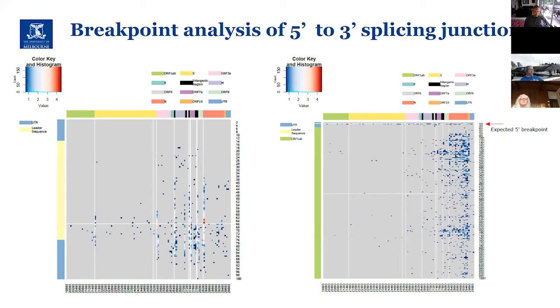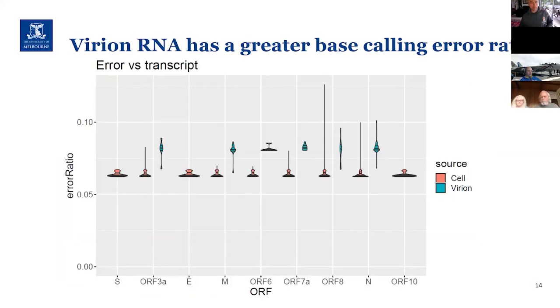Now, as to whether the ORF10 material gets translated into protein, that may not be the case because it will probably encounter a stop codon before it gets to that point. But nevertheless, it's interesting that ORF10 is being added to many transcripts, and we speculate there may be some kind of transcript stability role involved in it.